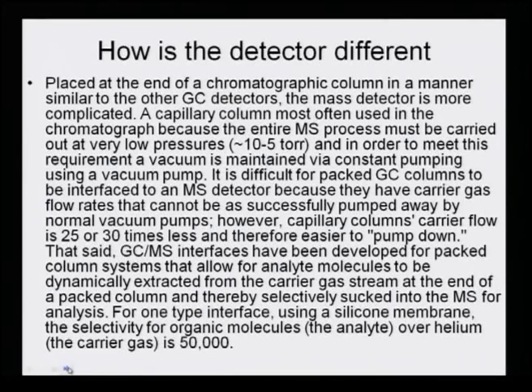However, with capillary columns the carrier flow is about 25 to 30 times less, therefore it is easier to pump down the gases that are flowing through the capillary columns. And as said, GCMS interfaces have been developed for packed column systems also, that allow the analyte molecules to be dynamically extracted from the carrier gas stream at the end of the packed column, thereby selectively sucking them into the MS for analysis.